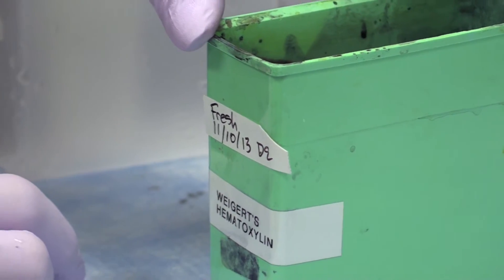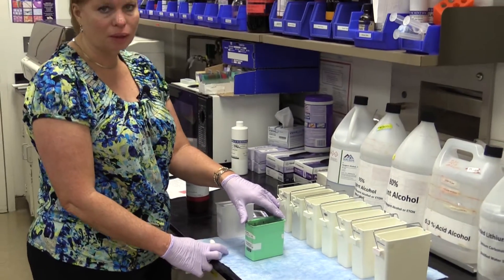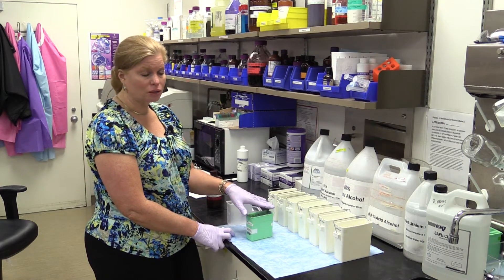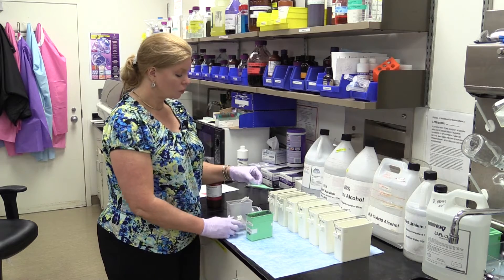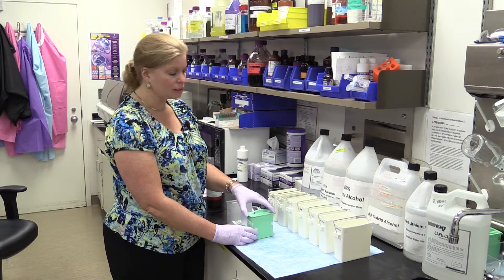When it's first freshly made, it's not quite as dark and ripened as it would be. Normally we make it 50% old and 50% new solution, but the old one was getting really old so I wanted to go ahead and change it. So I'm expecting it to actually take a little bit longer today to stain, or possibly to stain — I'll just take a look at it as I'm going along.